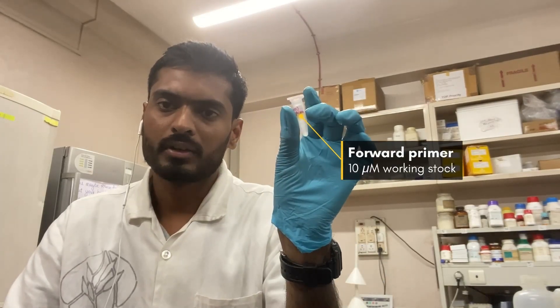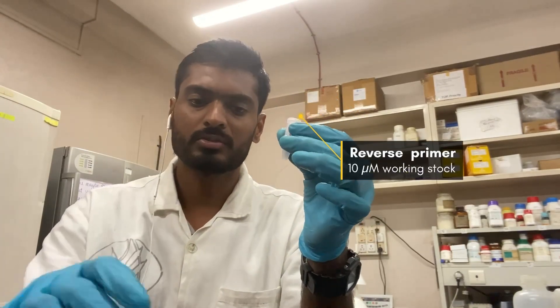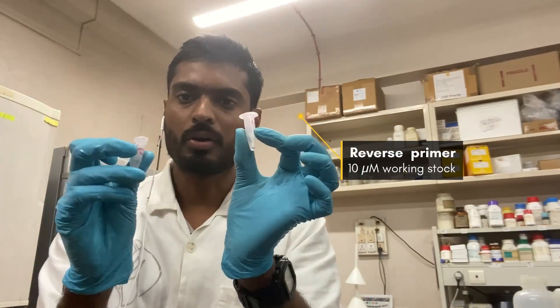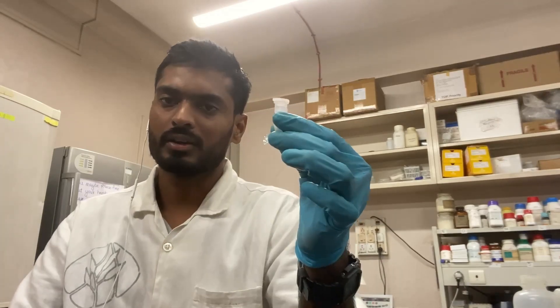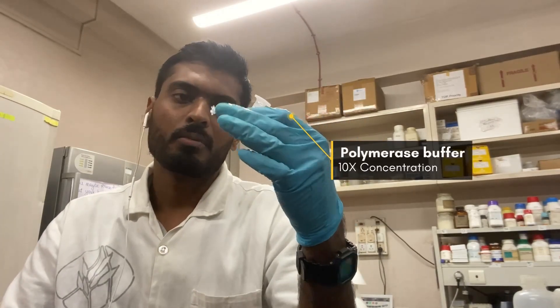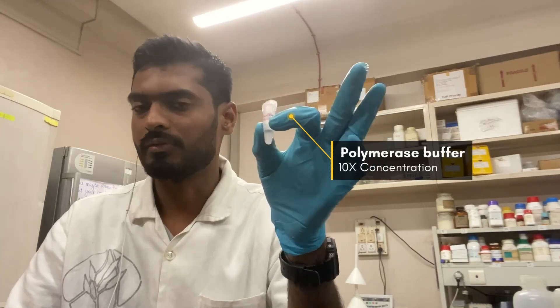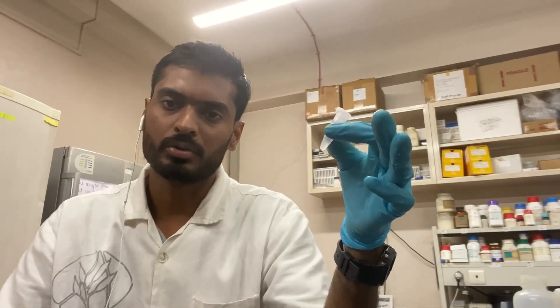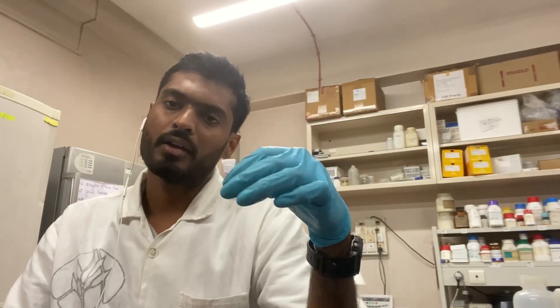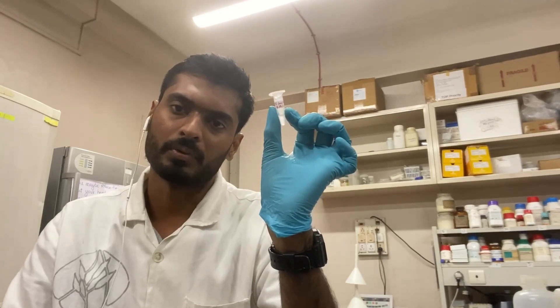Then we need the forward primer to amplify our gene of interest, as well as the reverse primer. Here we have both forward and reverse primer. Then we will need the buffer. The buffer we have is actually Q5 DNA polymerase buffer. This buffer will vary according to which polymerase you are going to use in your reaction. I have the Q5 DNA polymerase, that is why I am using this Q5 DNA polymerase buffer.